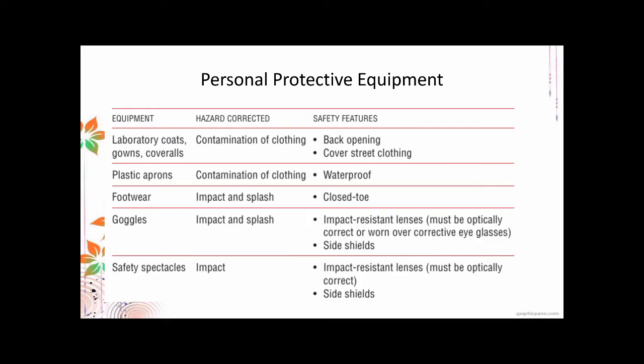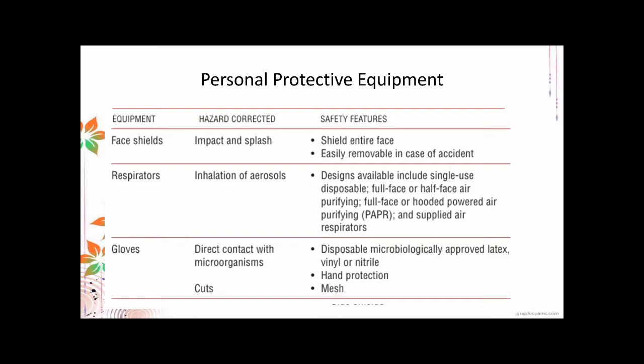And then you can also have face shields or side shields. So safety spectacles, similar to goggles. So you have impact resistant lenses. So for people, if you have the money, you can buy safety spectacles that can be optically corrected, your safety glasses that also have your prescribed lens grade, if you have the money to do that.